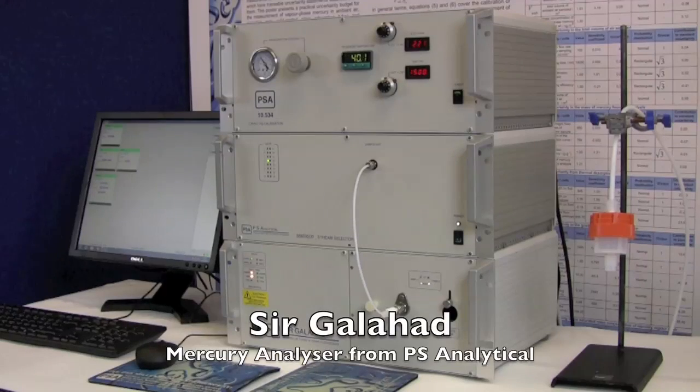This is known as the Sir Galahad Analyzer and it's based on amalgamation coupled to atomic fluorescent spectrometry.